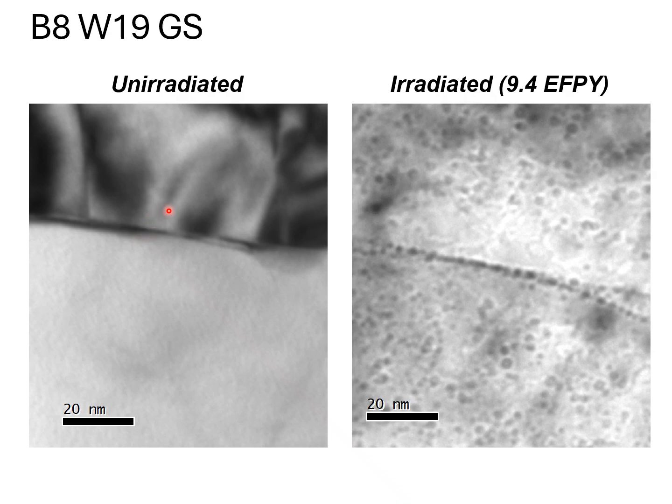So you were wrong. You have to think of something else. And I scratched my head and I thought, well, that doesn't look right, because the image didn't look like a very sharp image. And I spent 20 minutes at the microscope, and then bing, there you go.